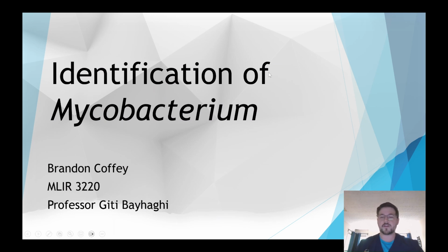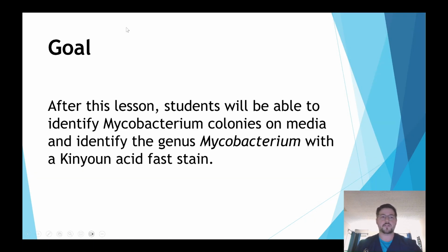Hello, my name is Brandon Coffey, and today I'll be lecturing on the identification of mycobacterium. The goal for this lecture is that after this lesson, students will be able to identify mycobacterium colonies on media and identify the genus Mycobacterium with a Kinyoun acid-fast stain.